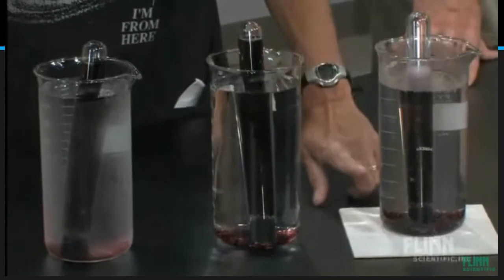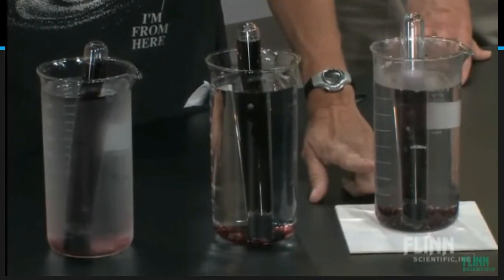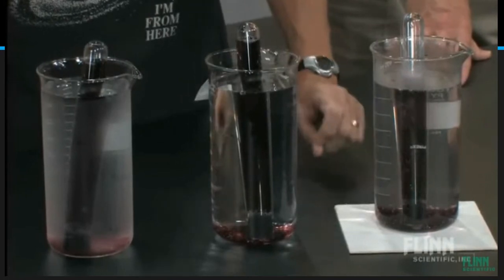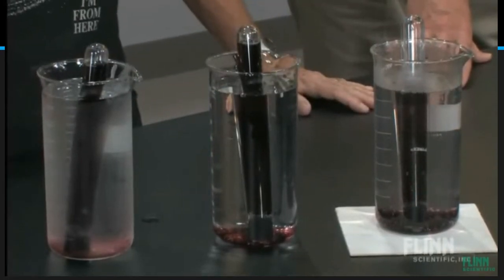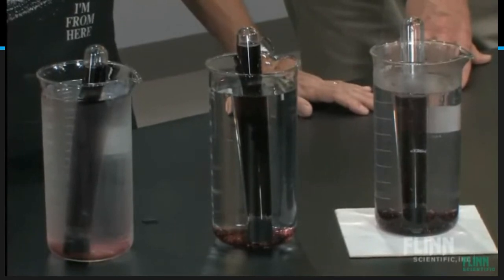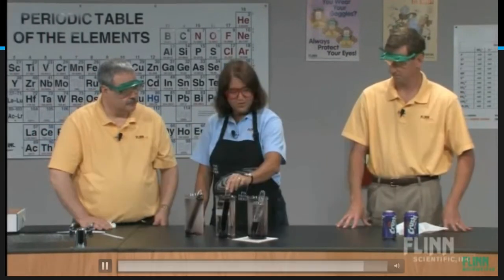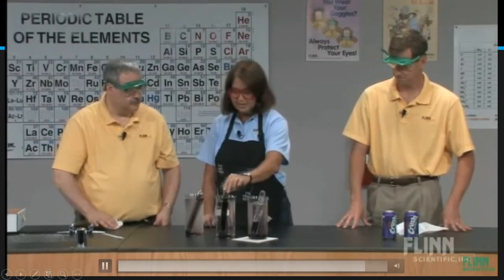If you can zoom in on the hot solution, which is the third beaker here, look at the number of gas bubbles that you can see escaping along the sides. Is that real obvious to those of you in the audience? Okay, that tells you something right there: the gas, carbon dioxide, which is providing the carbonation in this case, is going to be less soluble at the higher temperatures. And that's really clear.